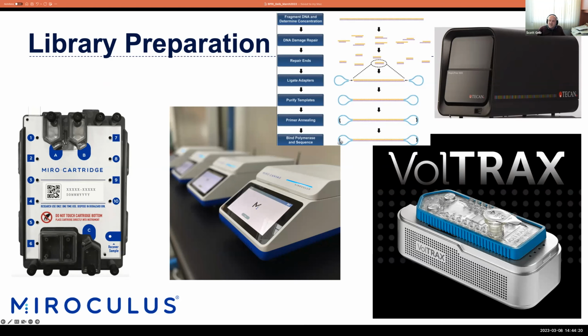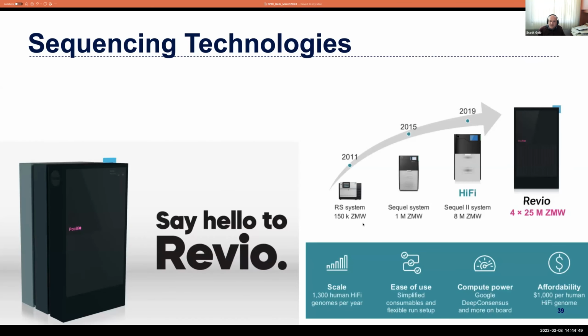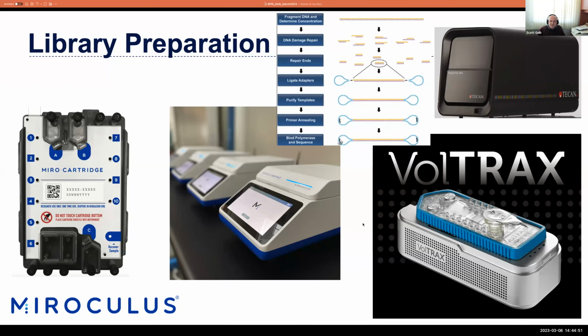And then it's going into the old school liquid handling companies. Tecan has this toaster, I forget what it's called. It's for Illumina library prep, but probably down the line they could adapt it for high molecular weight. It's cheap, and it basically is a mini liquid handler that just does 8 preps at one time. Or if you have on site a Biomek or Tecan or whatever, you could automate the preps yourself. Any questions on those things? This is me just kind of throwing out random technologies that haven't been sort of proven out there.